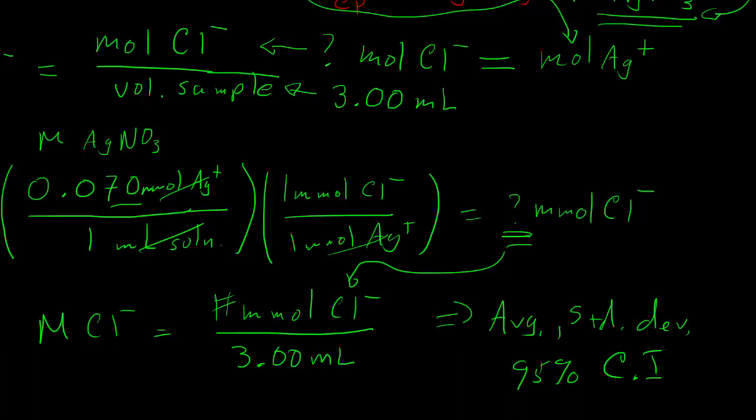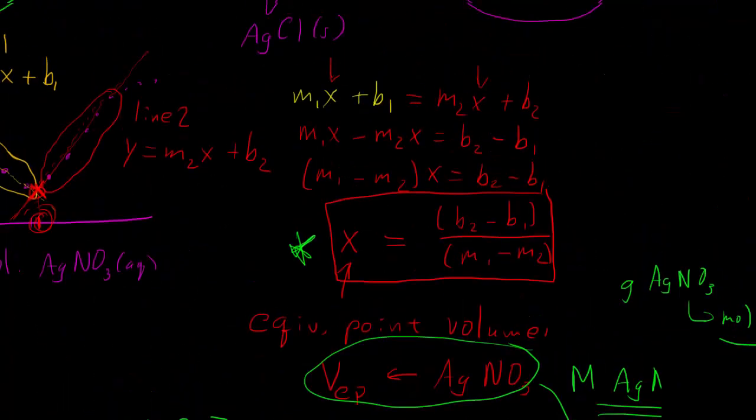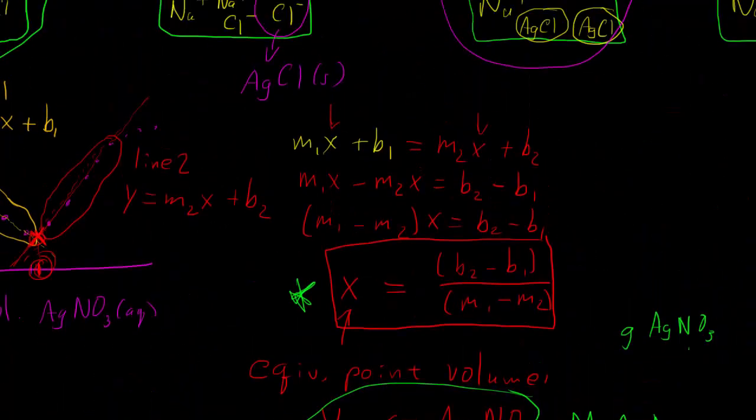Now I'm going to switch over and show you how we use Microsoft Excel to do this fancy stuff that I was talking about up here, where we find the intersection of this line.